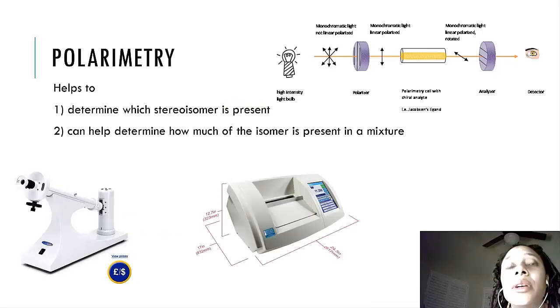The polarimeter will... And before I forget, the refractometer, the number that you get back is a clue as to the evidence of a particular compound. It can also tell us kind of how clean the compound is.